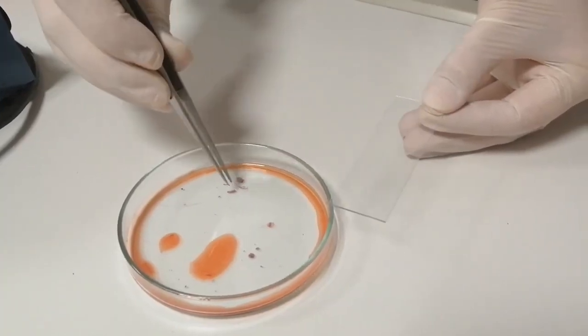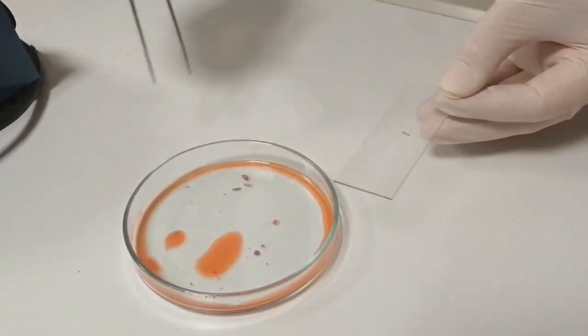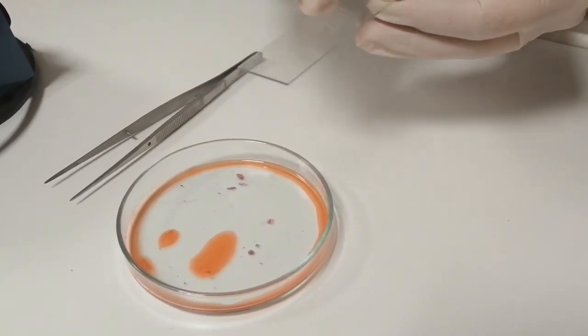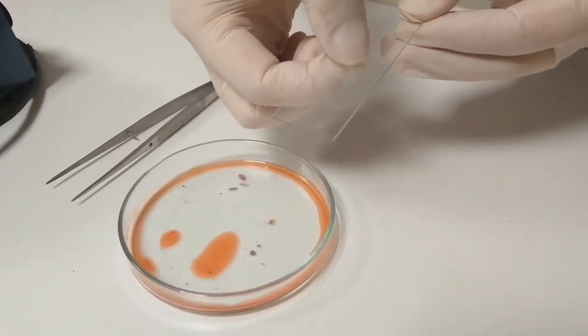Now, we take one of the root tips from the watch glass and place it onto a slide and also a cover slip on the slide.